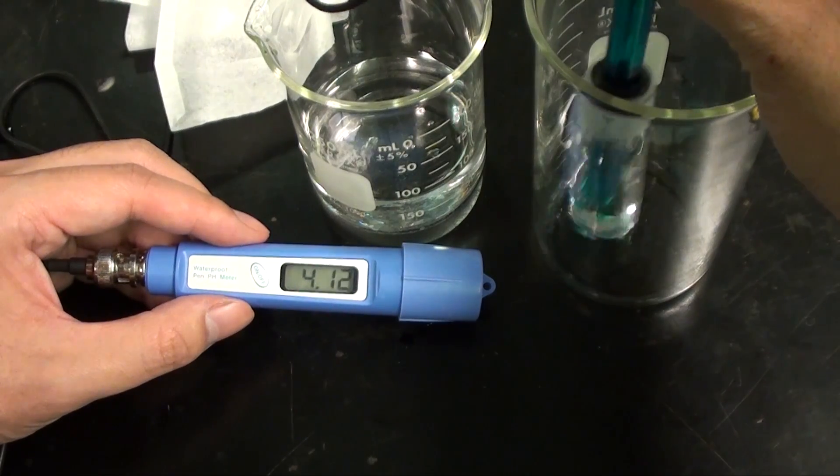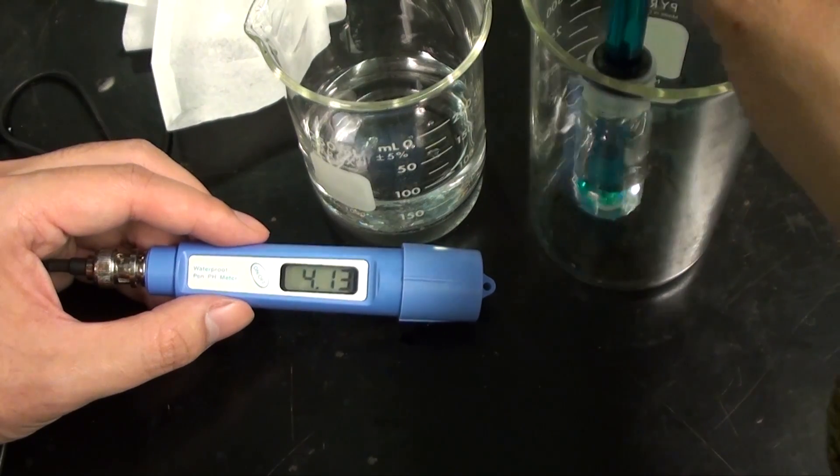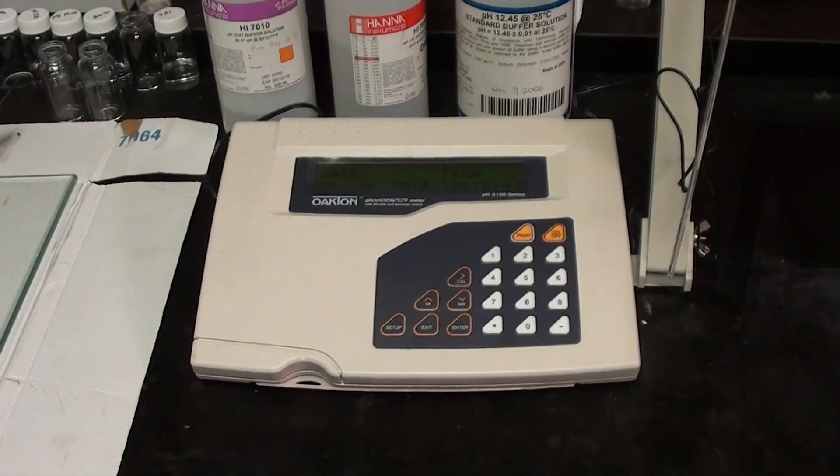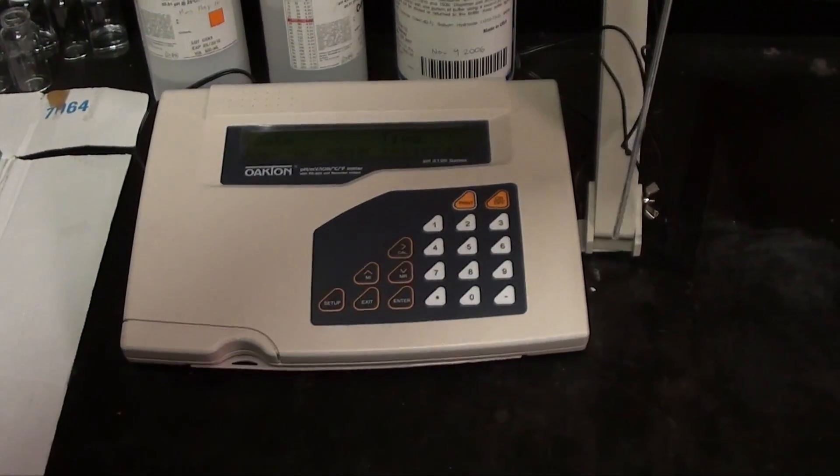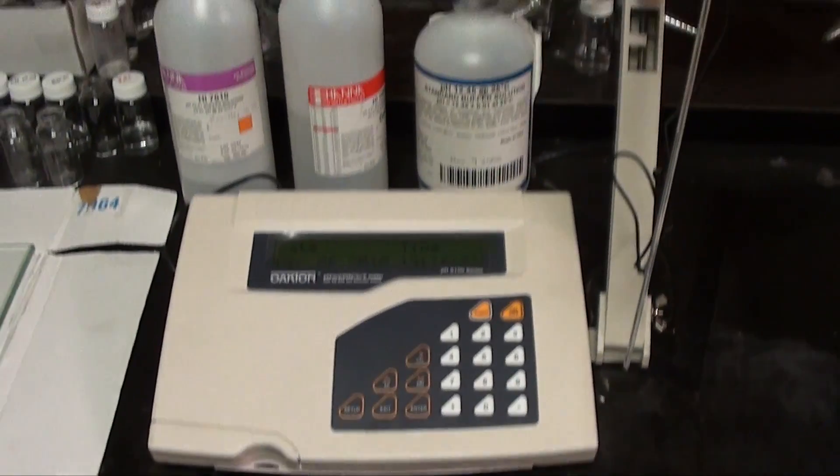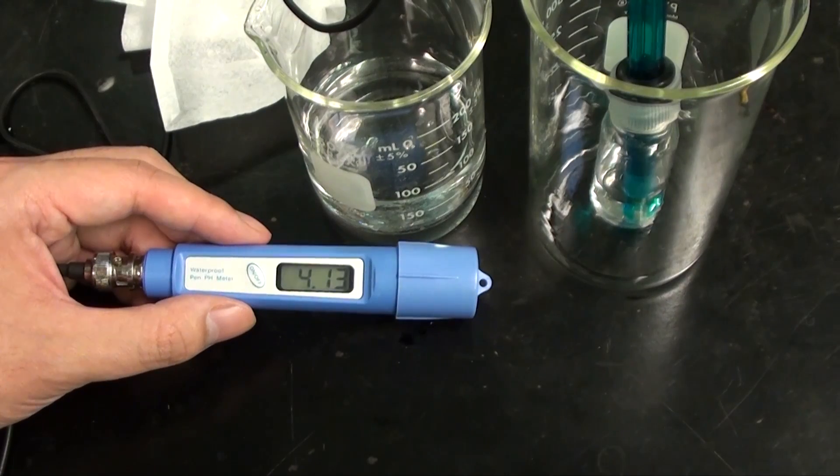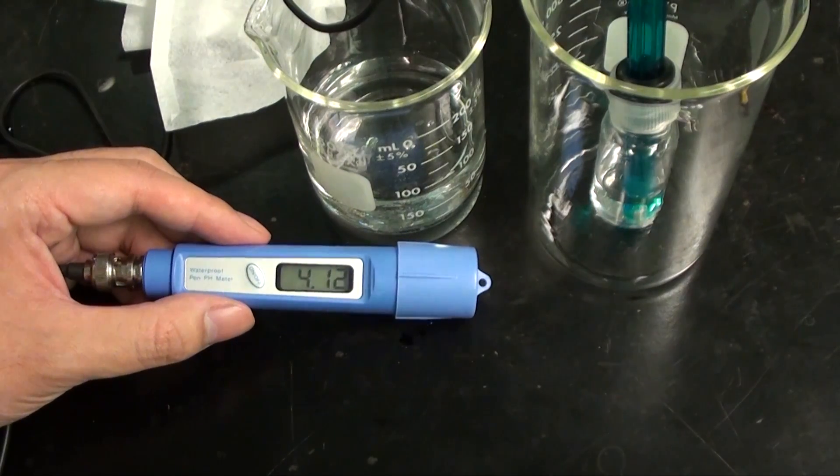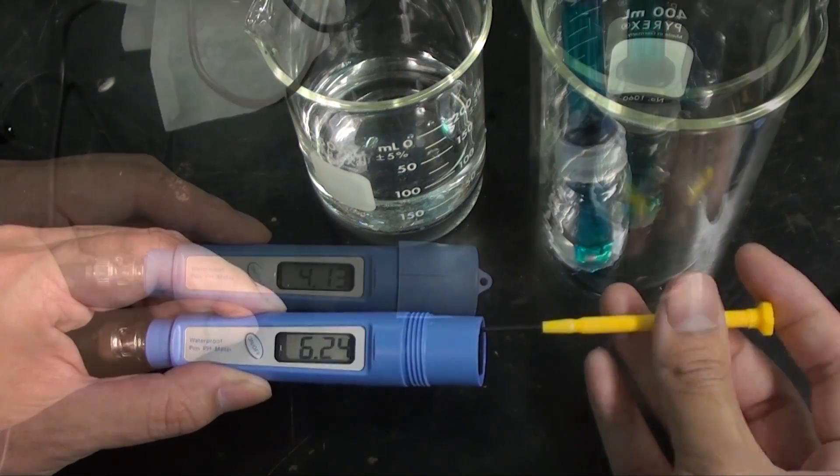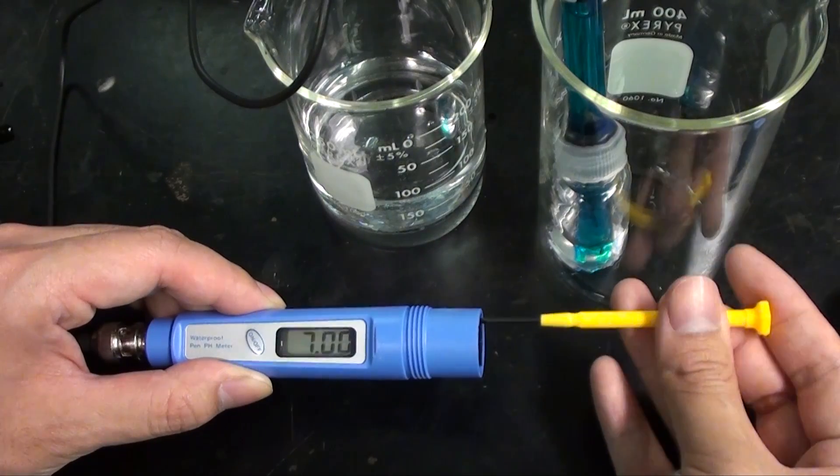The slope of the pH response is not correct. On a more advanced instrument we can calibrate this new point and the onboard computer would automatically readjust the slope. But for this cheaper instrument we don't have that kind of ability. If we readjusted this point we would misadjust the previous point.